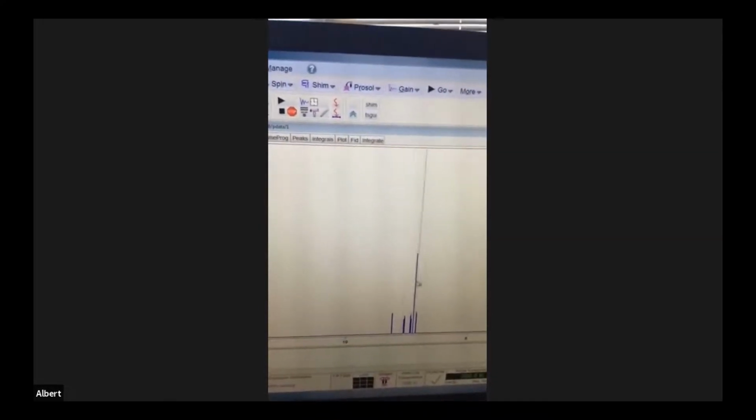That's a very clean sample. This has got to be sample 3. This can't be the crude because there's no salicylic acid left over here whatsoever. All right, so this is pure and not crude. So this is sample 3. I said crude or 3, so this is 3. So that means Taj has the crude.